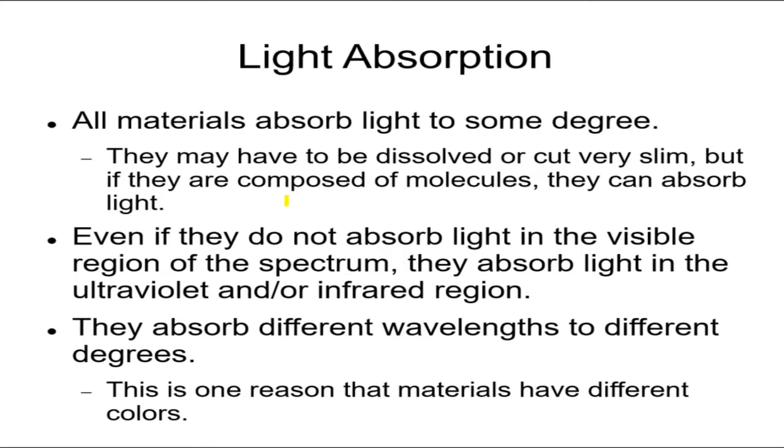Now, they don't always absorb all the frequencies of light. They don't, of the visible light. Sometimes they absorb only in the infrared. Sometimes they absorb only in the ultraviolet. Sometimes they absorb the blue and not the red. Sometimes they absorb the yellow and not the blue. Many different possibilities.